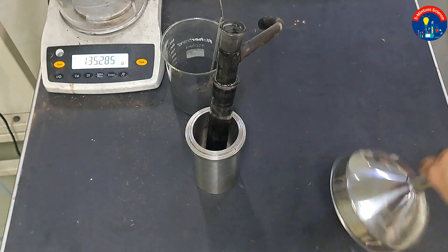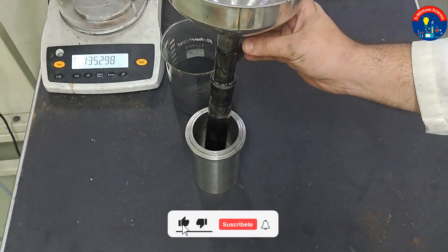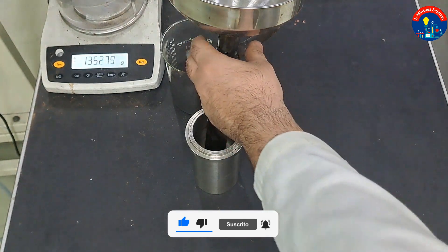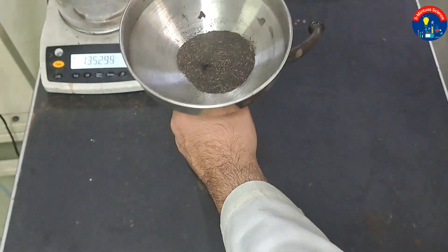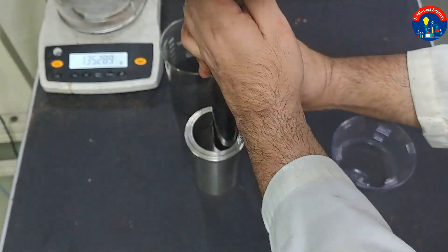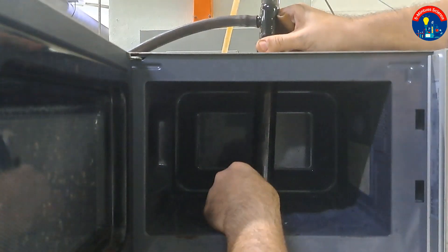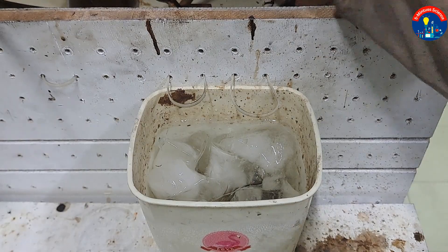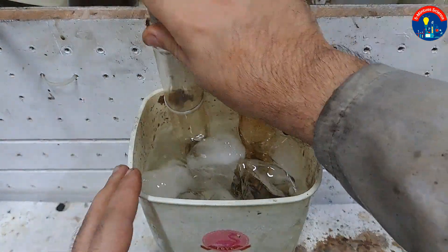A crucial part of bio oil production is how to cool the hot gas. I utilize an ice water pool and a condenser.